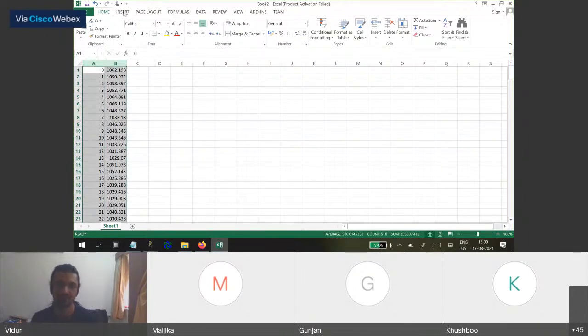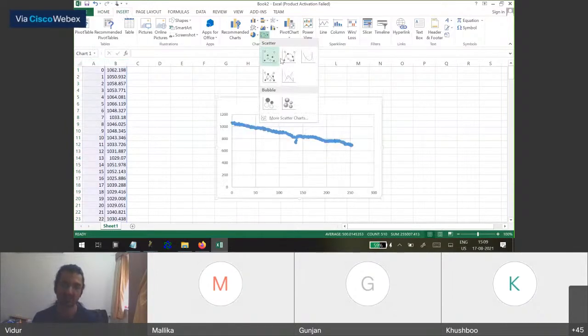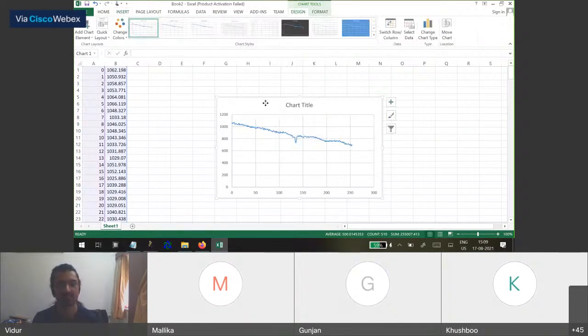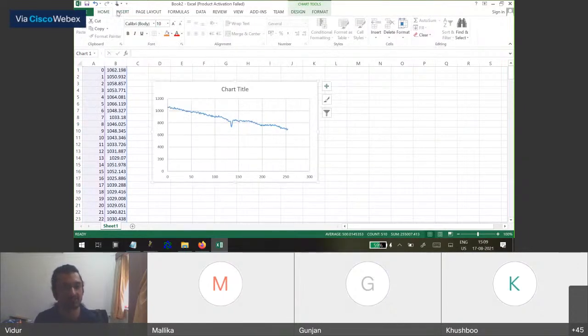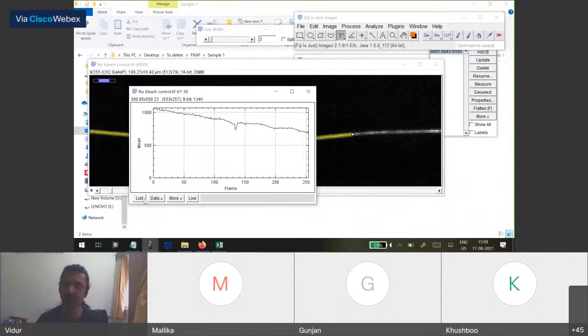And here, if you just plot this, what you can see, just use a better plot, 1 second. How did you come to the values? Okay, 1 second, I'll just go back. Here, when you have this plot, you just have to press list, which is the bottom left button.